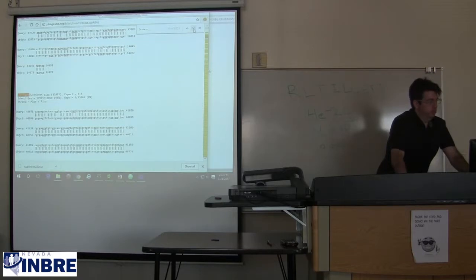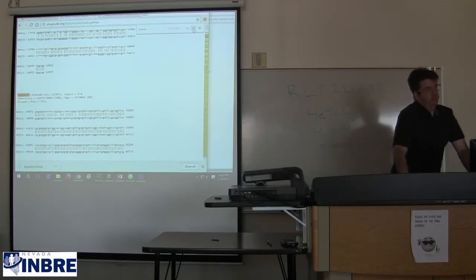There's a third alignment that tells a similar story. They're getting less identical though in these regions. The bit scores are smaller, so it's either a shorter alignment or less perfect alignment, and in this case it's both. It's almost 13,000 letters aligned with 98% similarity.